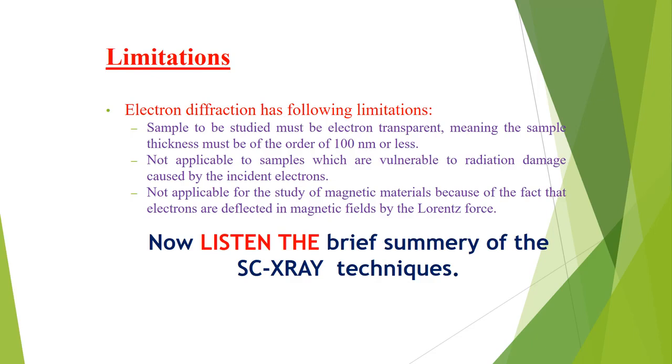But in single crystal diffraction, monochromatic radiation hits a sample, and it is rotated and manipulated to bring different planes into diffracting condition.